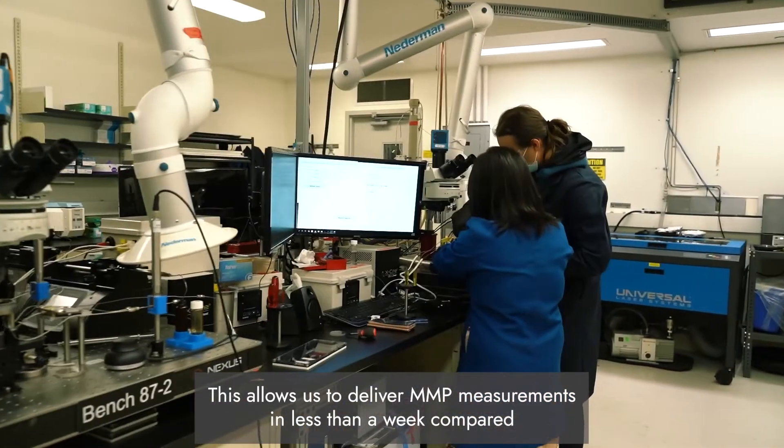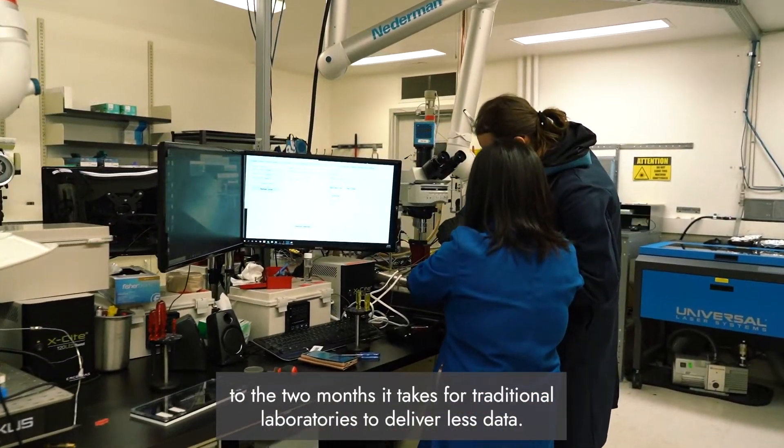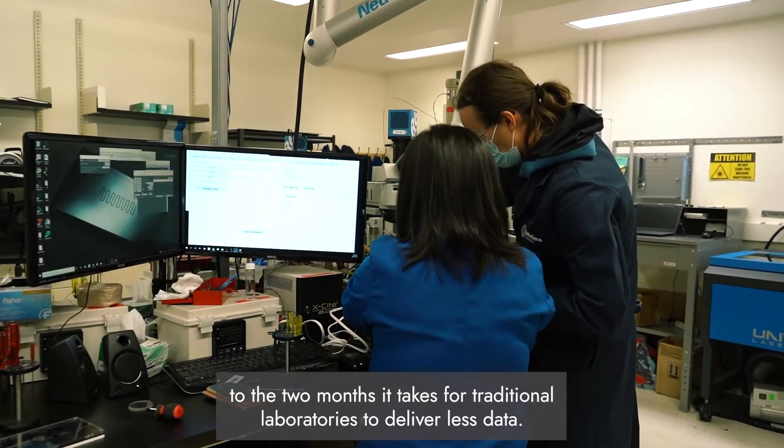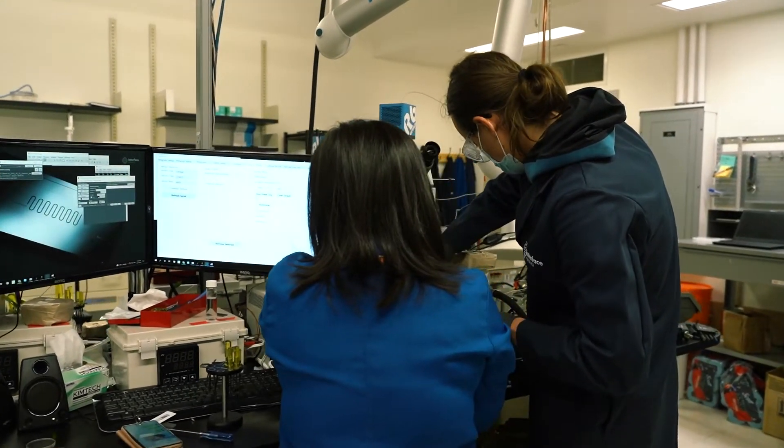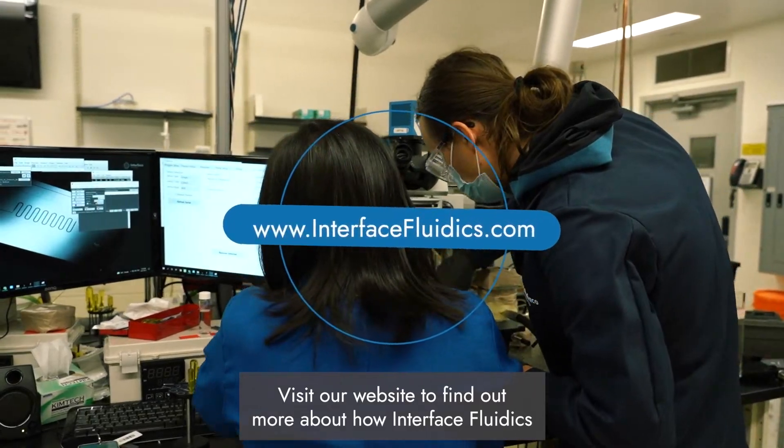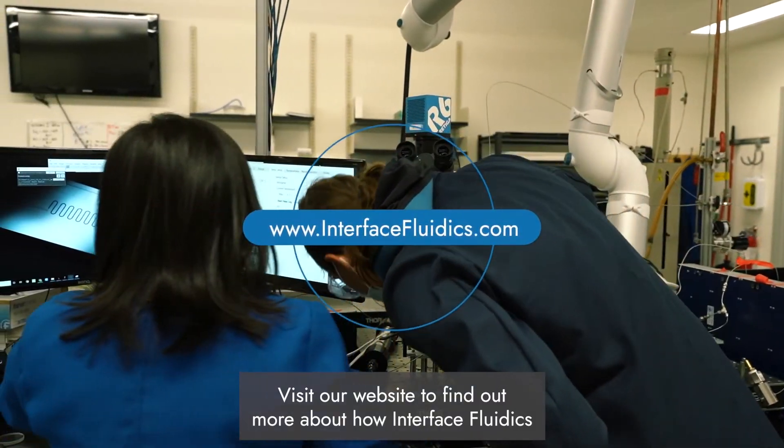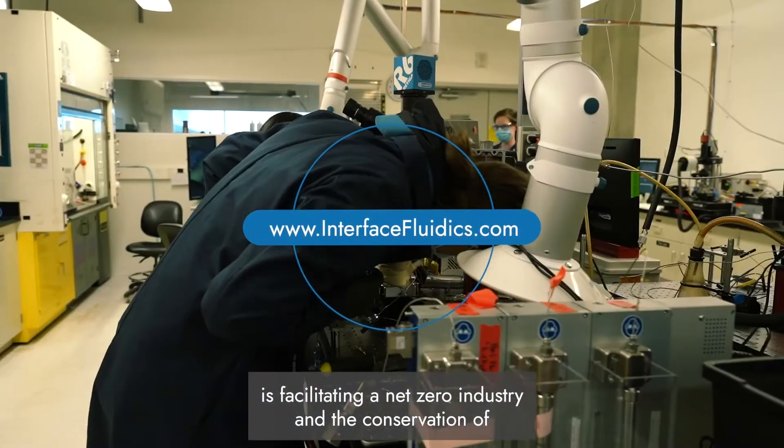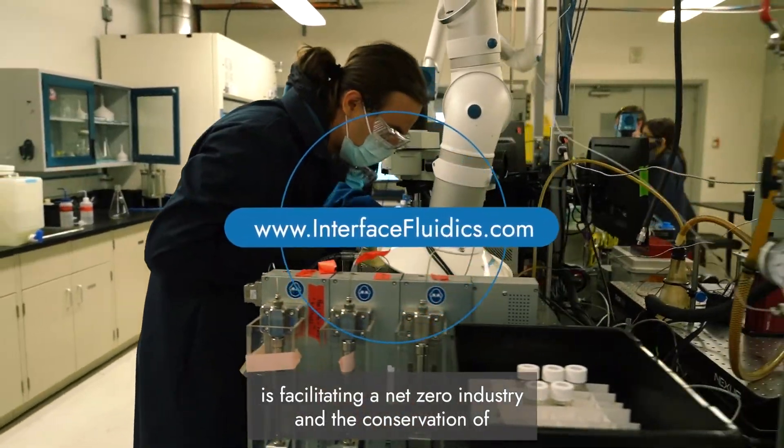This allows us to deliver MMP measurements in less than a week, compared to the two months it takes for traditional laboratories to deliver less data. Visit our website to find out more about how Interface Fluidics is facilitating a net-zero industry and the conservation of finite resources.